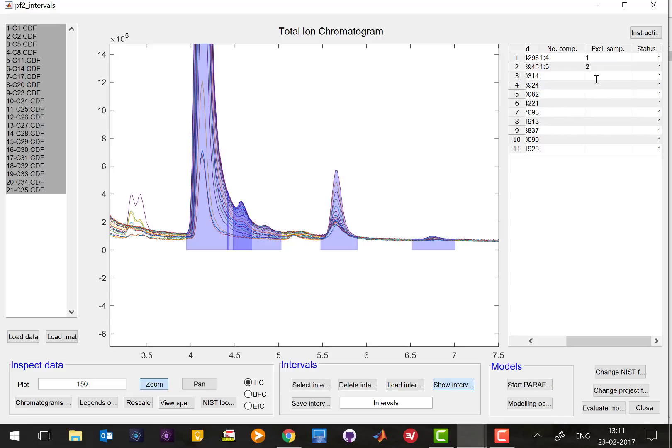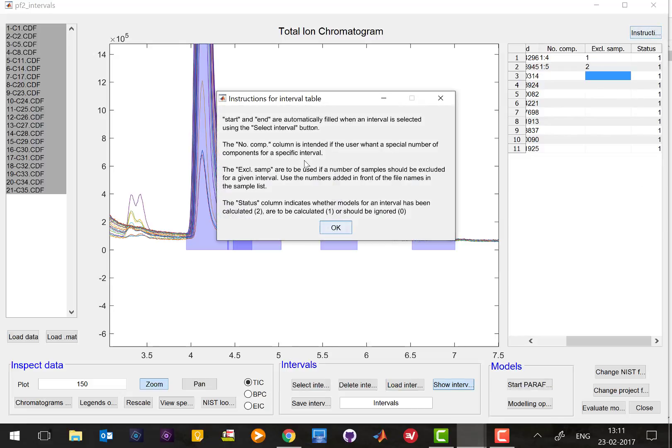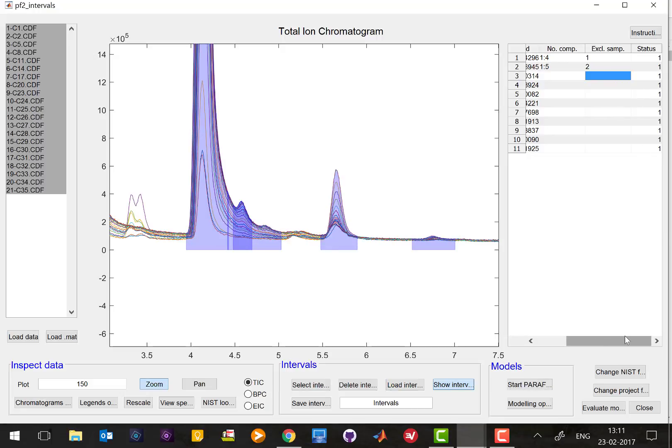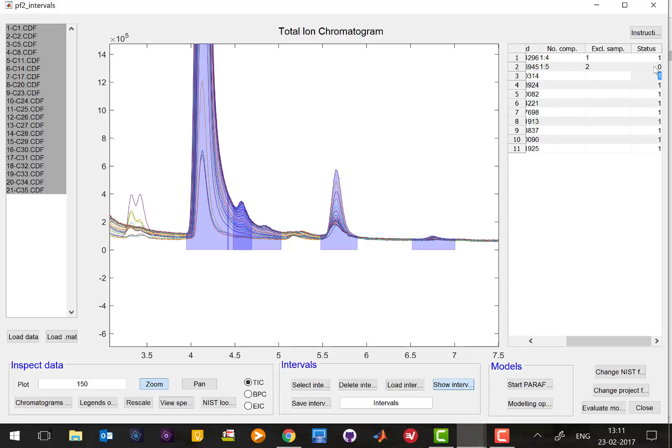And status here says one means that it has to be calculated and two means it is already calculated interval and zero, if you put zero here for example here zero which means you calculate all the PARAFAC2 for all the intervals but interval two.